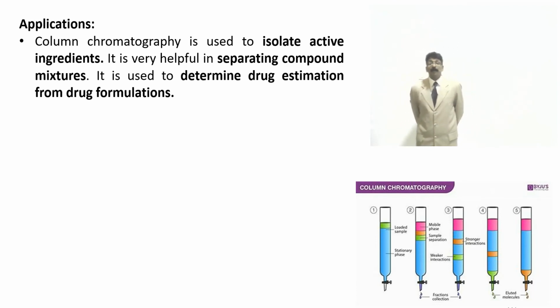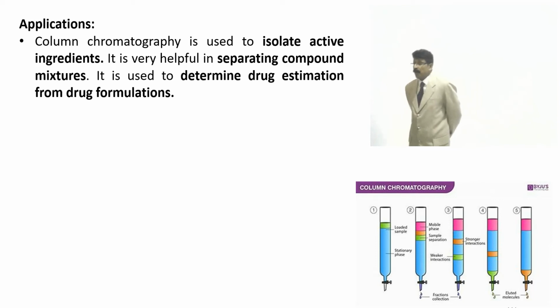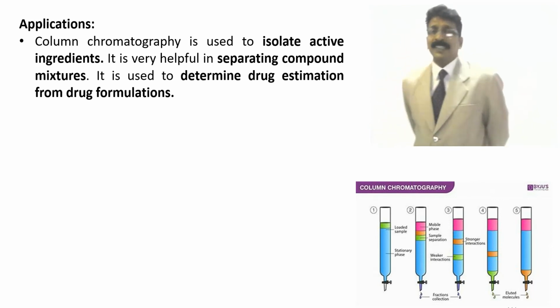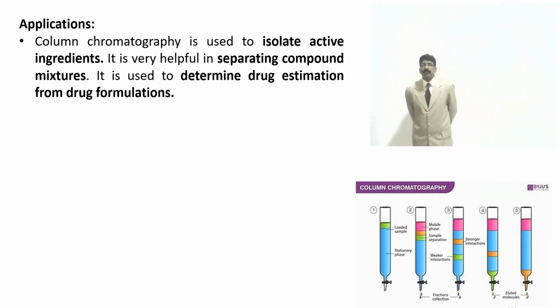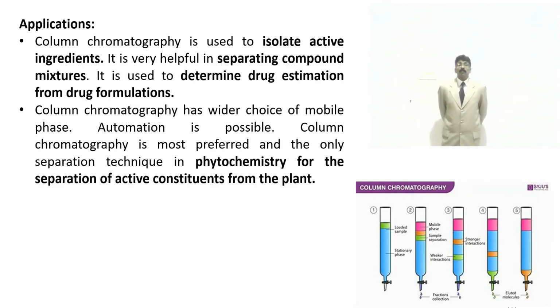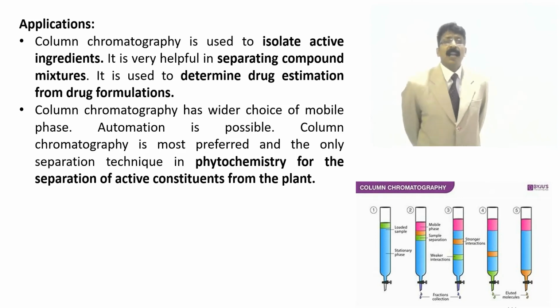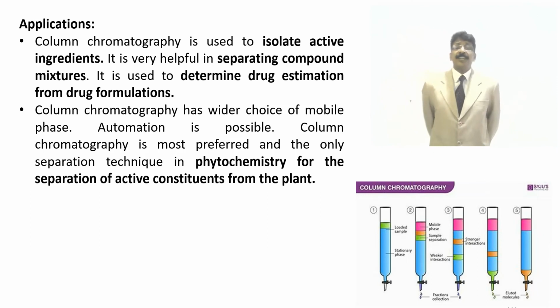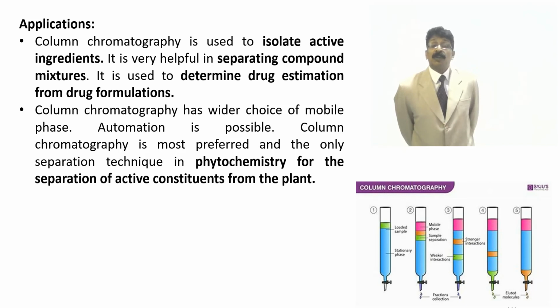TLC also, the students may know how far TLC has been utilized, and how it has become familiar for all the students, for the project and the lab, for the teachers, and also for our labs. They are very familiar with these chromatography techniques nowadays. Column chromatography has a wider choice of mobile phase, and automation is possible. Column chromatography is the most preferred and the only separation technique in phytochemistry for the separation of active constituents from the plant.